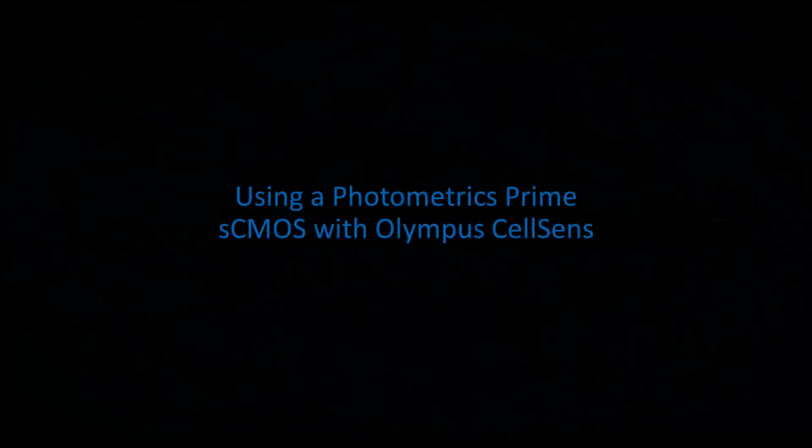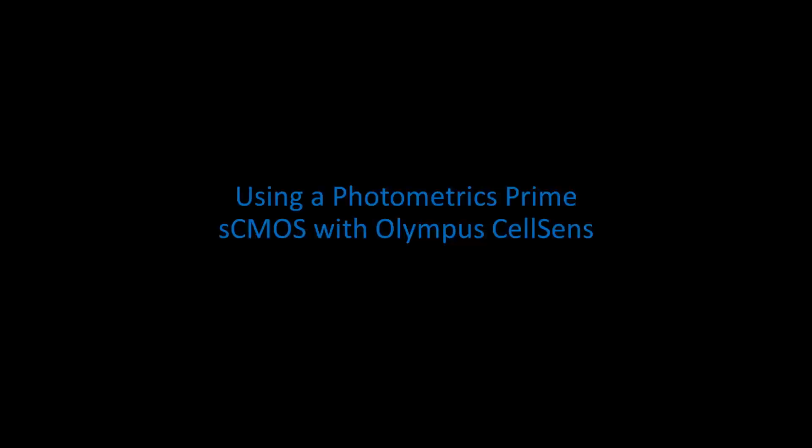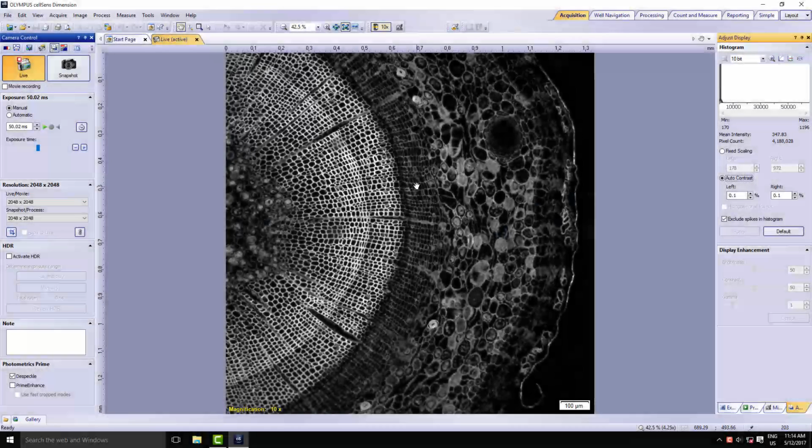In this video, we're going to look at using a Photometrics Prime sCMOS camera inside Olympus Cellsens. To start with, we'll quickly have a look at some of the features of the Prime sCMOS camera. Here it is inside Cellsens.